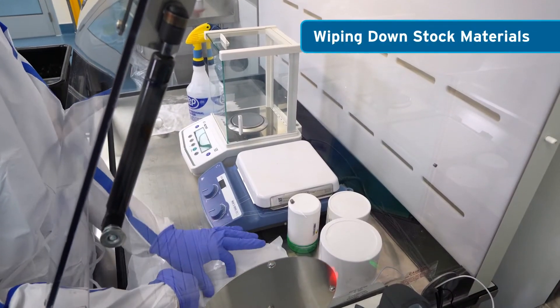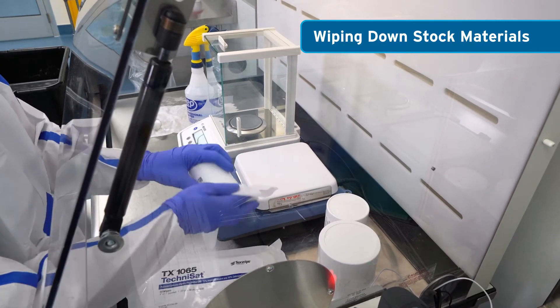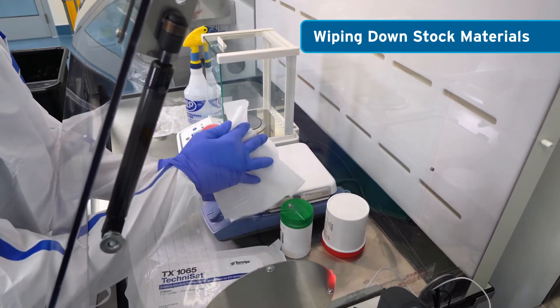Micronized powders can statically charge to the outside of plastic containers. It is wise to wipe down the bottles to remove any powder residue prior to taking them out of the CVE.